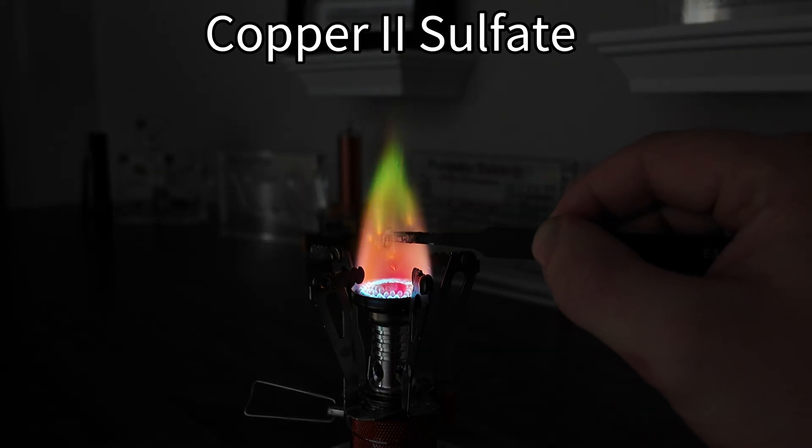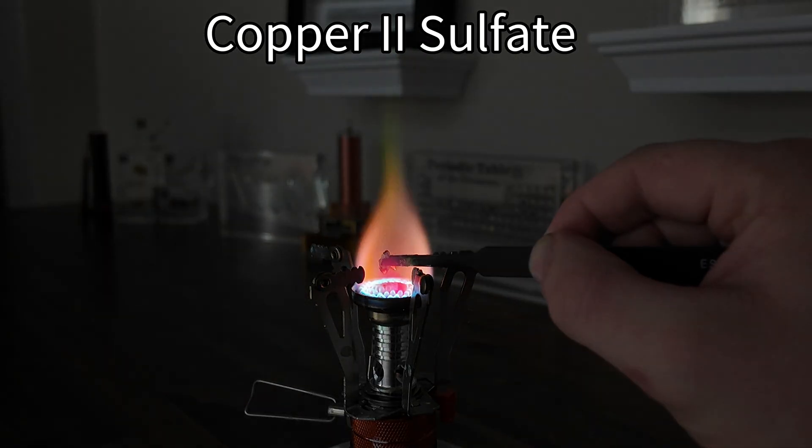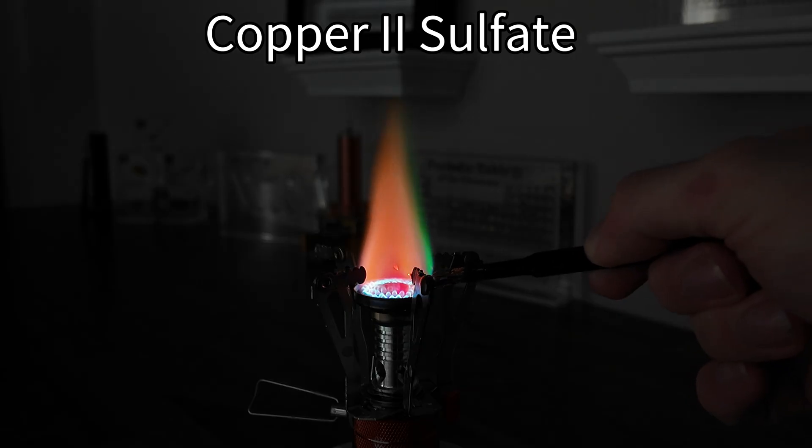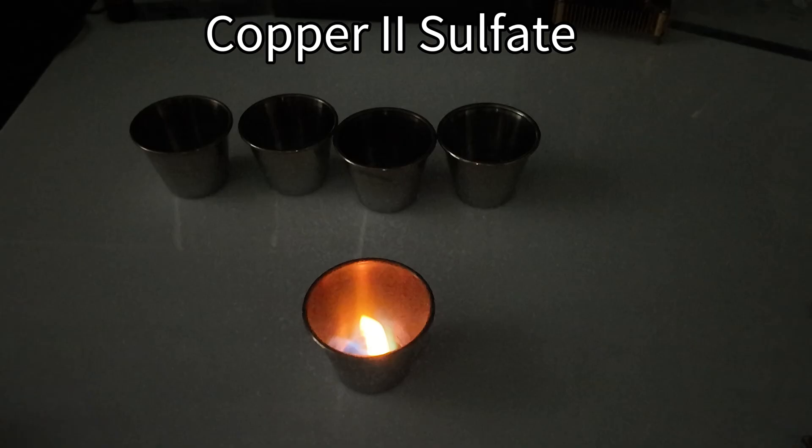So as you can see, when the copper-2 sulfate is heated in the flame, it turns the Bunsen burner's regular flame of orange-ish-bluish to this deep green color.